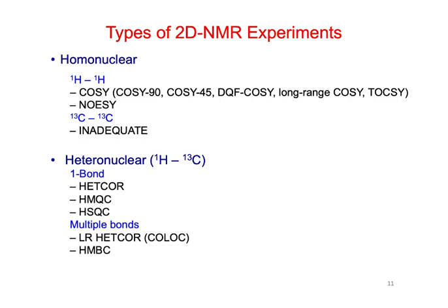Okay, so the next thing we want to talk about is the heteronuclear coupling experiments. We're going to separate these into one bond couplings and multiple bond couplings. We do have one more homonuclear one, which is a C13-C13 coupling, but we're going to save that to the end.